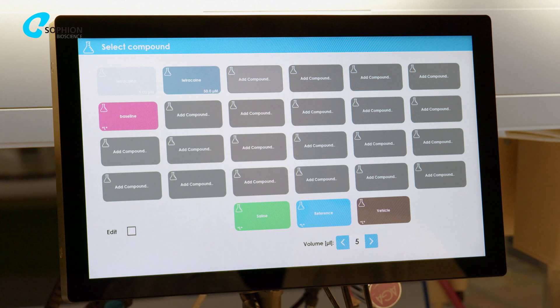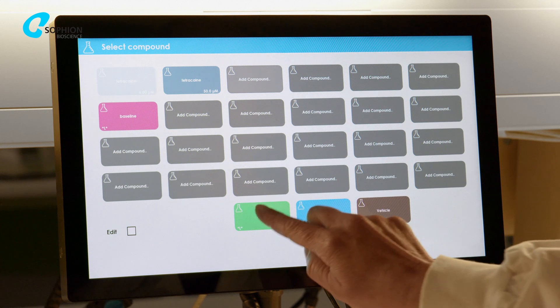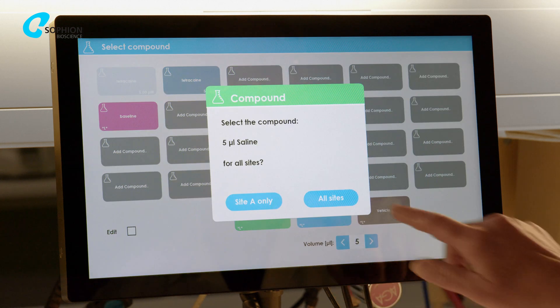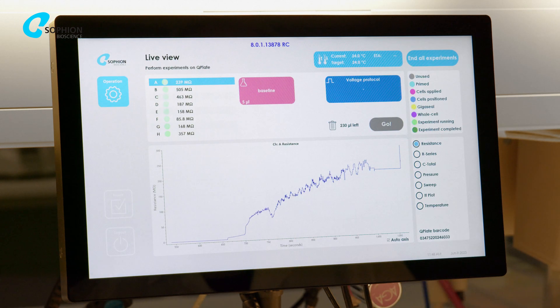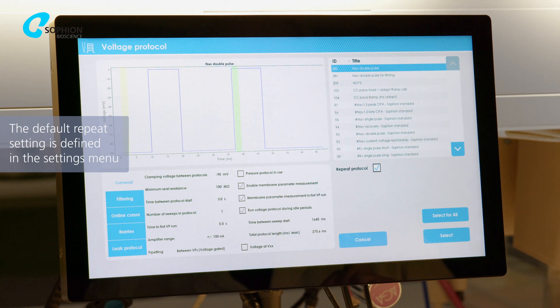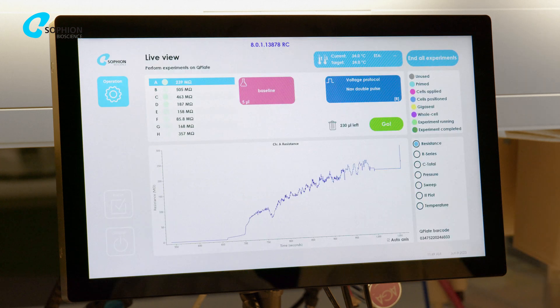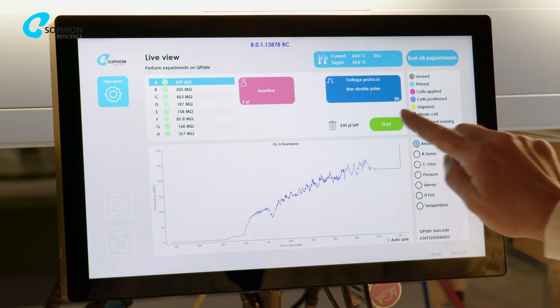To measure a pre-compound IV activation, you can select the Saline button in the compound map and select any predefined voltage protocol. Add a check mark to repeat the protocol. Press the Go button.